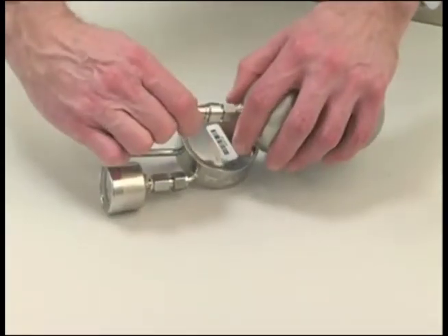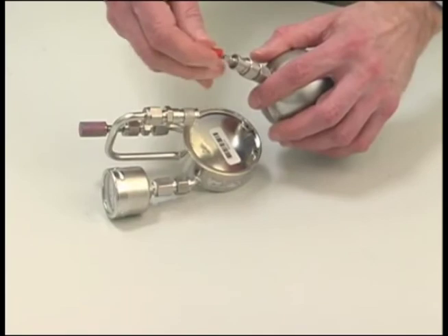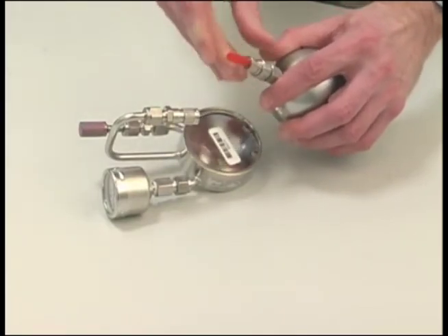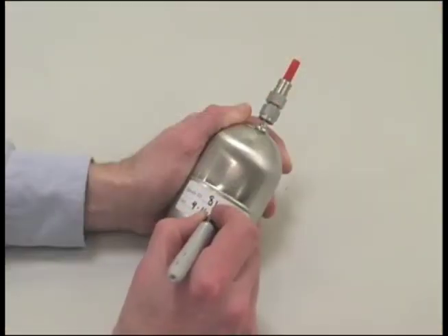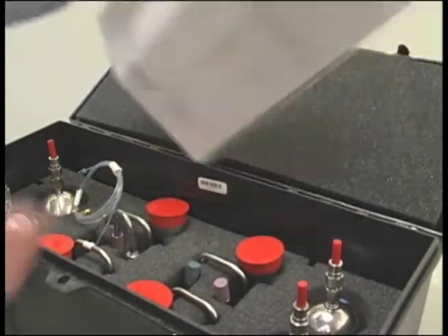When your sampling period is over, remove the regulator by pulling back the collar and slipping it off the can's inlet stem. Replace the protective cap, label the sample, and fill out the chain of custody. Repack and return everything to Galson Labs.